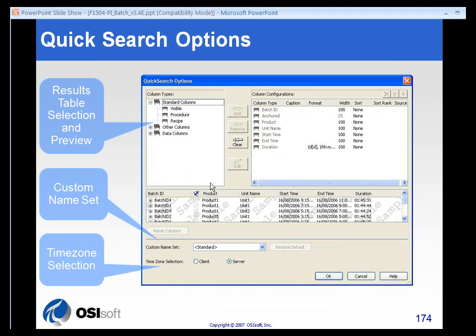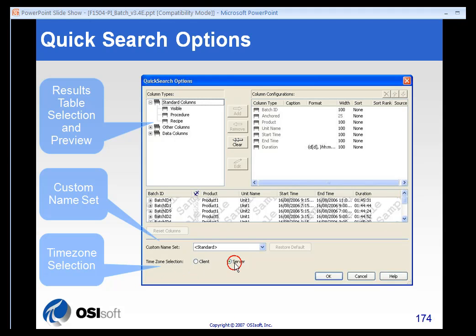Finally, you can set up your quick search options to show any columns or any type of data you want. So if you don't like showing batch ID, product, unit name, start time, end time, and duration, you can add other columns or data columns. The quick search tool is very customizable. You could even select the time zone you're using, whether server time zone or client time zone if you happen to be in a different time zone, or you can use custom name sets. We'll talk about those a little bit later in the course.